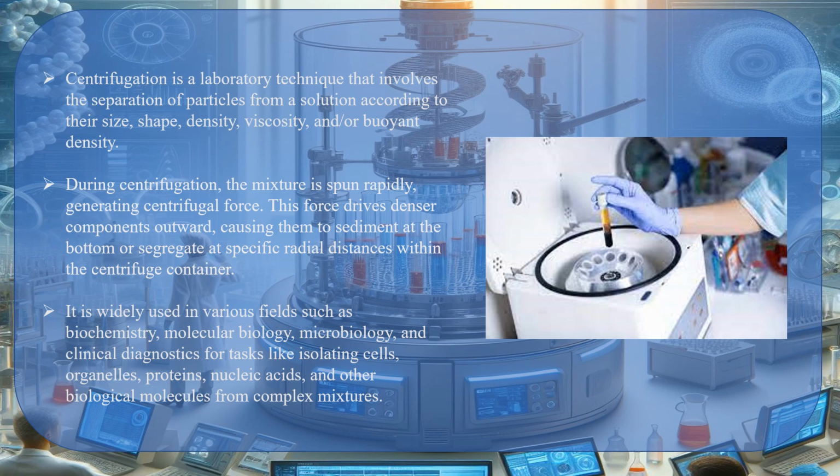So, centrifugation is a laboratory technique that involves the separation of particles from a solution according to their size, shape, density, viscosity, and buoyant density. During centrifugation, the mixture is spun rapidly, generating centrifugal force. The force drives denser components outward, causing them to sediment at the bottom or segregate at a specific radial distance within the centrifuge container.